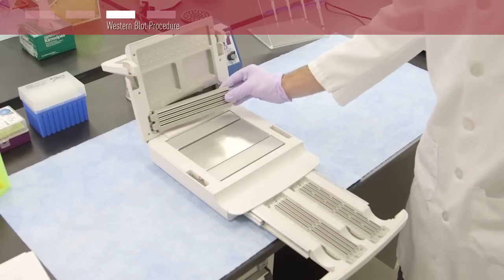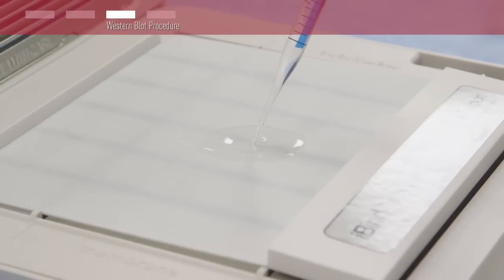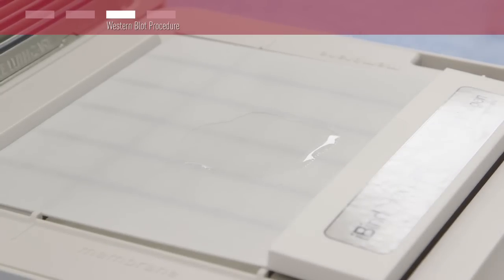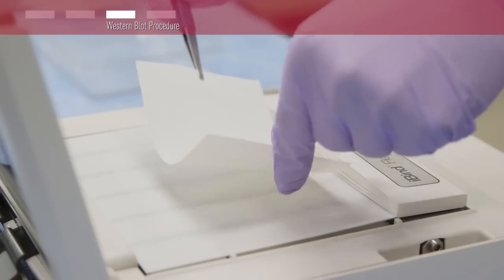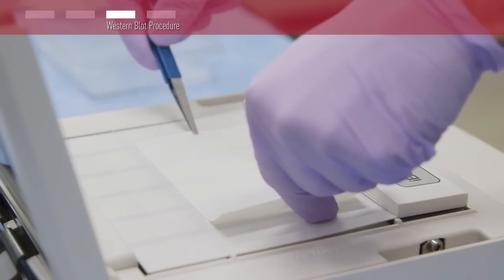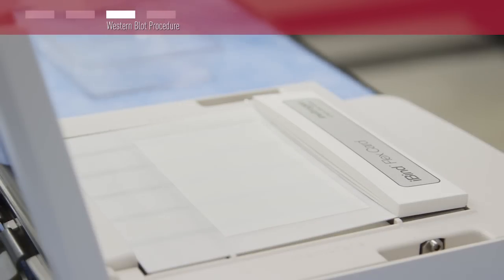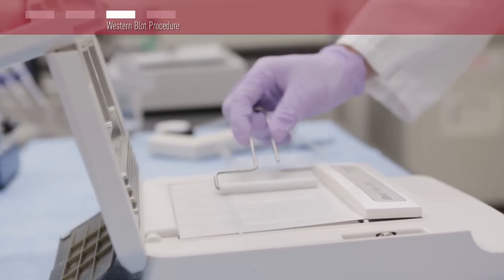To process a midi sized blot, first make sure the midi well insert is installed. Then add an additional 2 milliliters of 1X iBind Flex solution to the card, allowing it to pool per the quick reference card for midi sized blots. Place your blot protein side down across the membrane region indicated on the device, with the low molecular weight bands closest to the stack. Use the roller to remove any air bubbles.